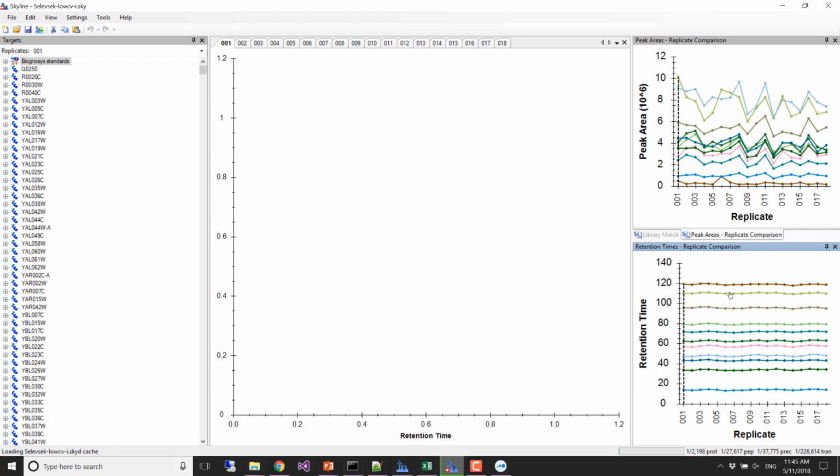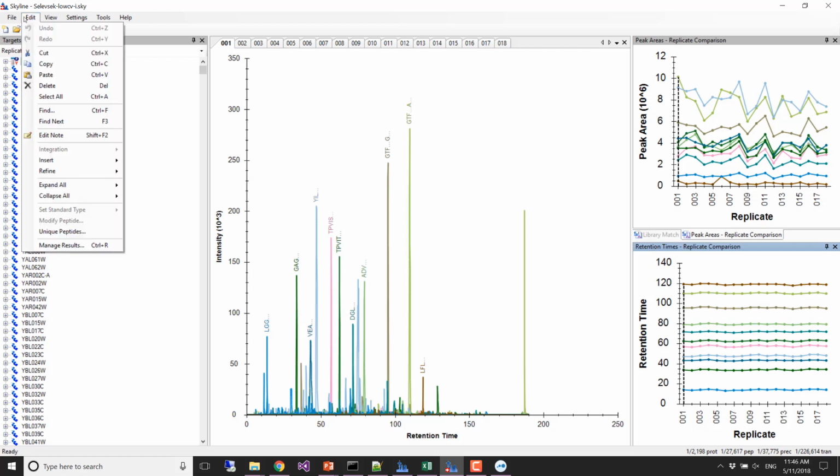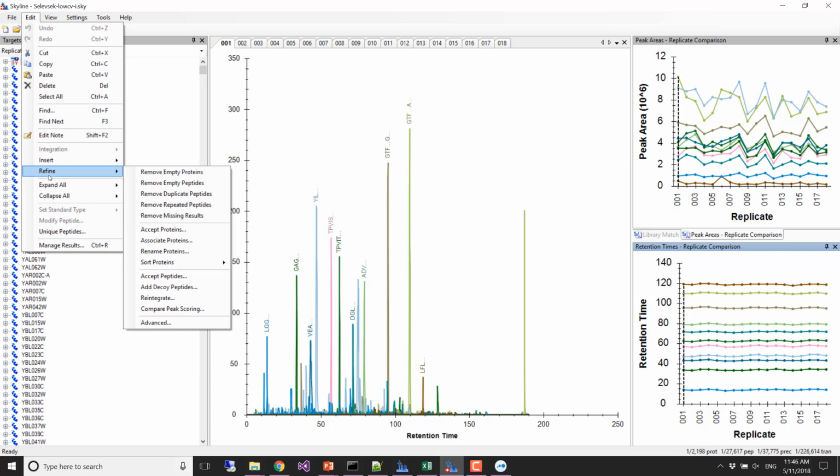Okay, so here once again the retention times look nice. The reproducibility of the peak areas of the IRTs is not so great. These are all spiked in. But so then the next thing we would do, so now you just imagine we waited for an import to finish. We just finished the import. And now we're going to go Refine and Reintegrate to do an mProphet model.